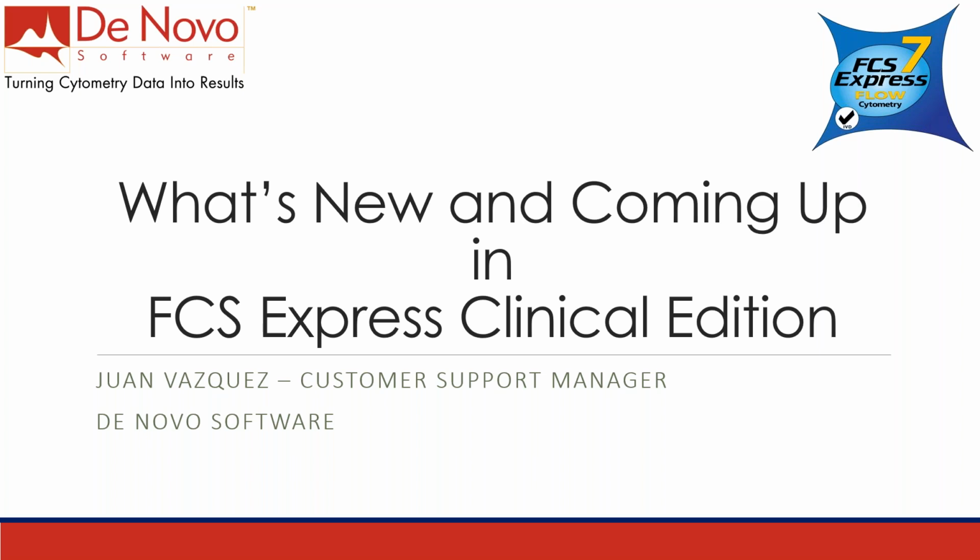Okay. So in today's webinar, we're basically going to talk about some of the new features in FCS Express Clinical Edition, as well as some of the features that are going to be coming out in the next release. Today's webinar is not necessarily going to focus on how to get started, how to start using FCS Express, or any of the basic functionality of FCS Express. It's basically about what's coming up, what's in the pipeline, and what you can look forward to using in FCS Express, either now or coming up in a later release, okay?